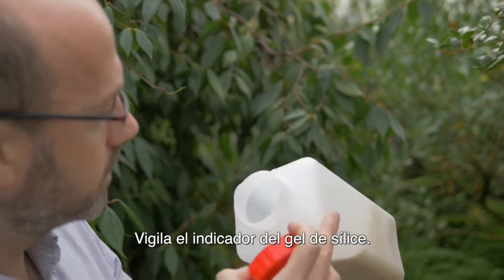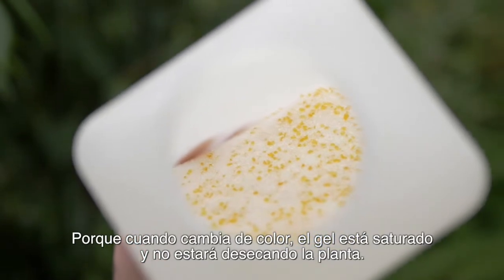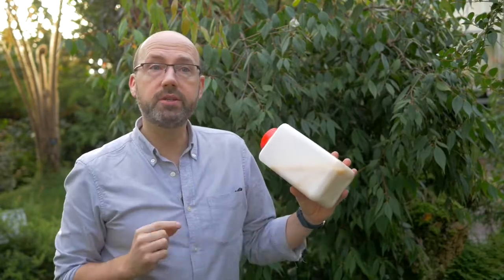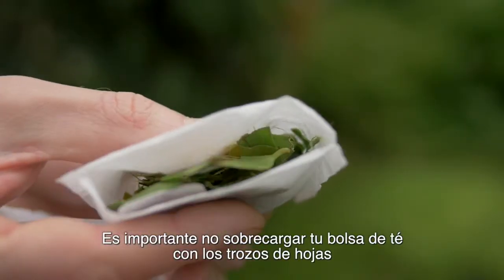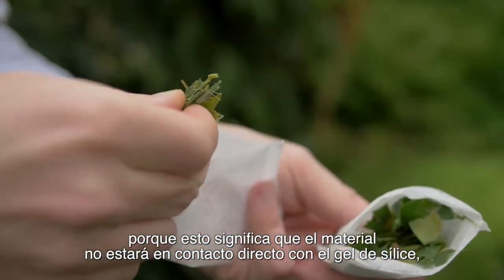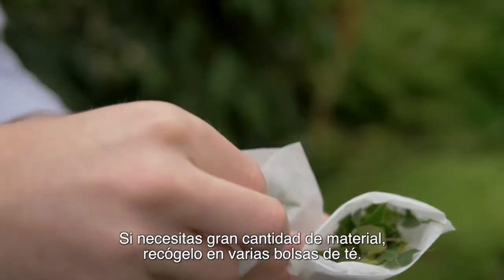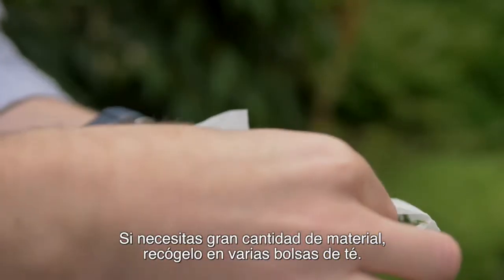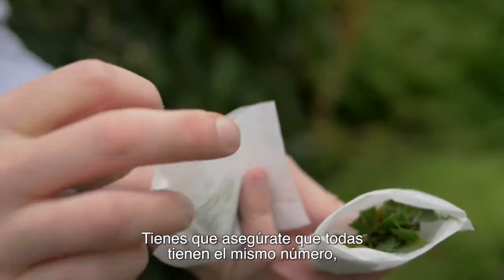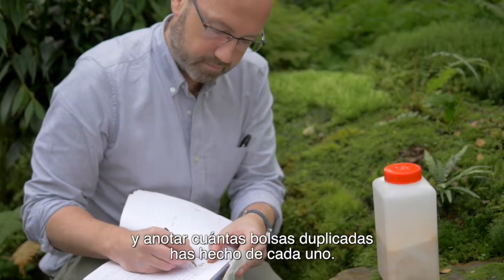Keep an eye on the silica gel indicator because when that changes colour, the gel is saturated and it won't be drying the plant — at that point you have to replace the silica gel. It's important not to overfill your tea bag with leaf material because that means the leaf material won't be in close contact with the silica gel and won't dry out very quickly. If you do need lots of leaf material, collect it in several tea bags, making sure they all have the same number, and make a note of how many duplicate tea bag collections you've made.